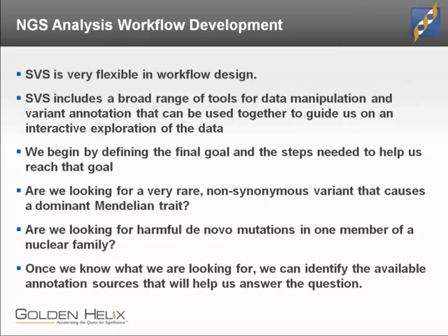And in terms of how we work with SVS, there's a broad range of tools for manipulating data, for creating annotation files, and for filtering and exploring the data. But really, it's a matter of knowing what the question is that you want to ask and defining the series of steps that will get you to that answer.